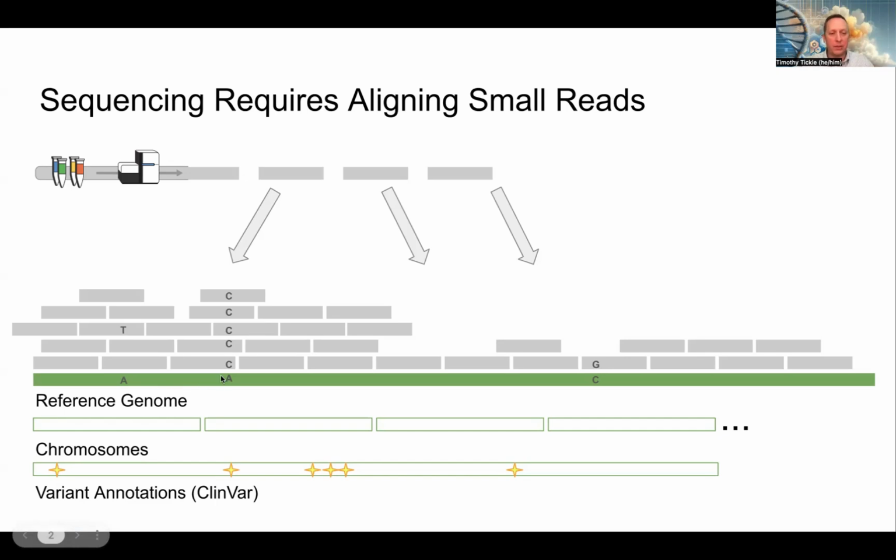One example is, for instance, mutations. In this example, at this location on the reference genome, there's an A nucleotide here. There's supposed to be an A there. But instead, in our sample, there was a whole bunch of C's. And so this is an example of where likely this is a mutation. And so you can do all sorts of analyses downstream with that.